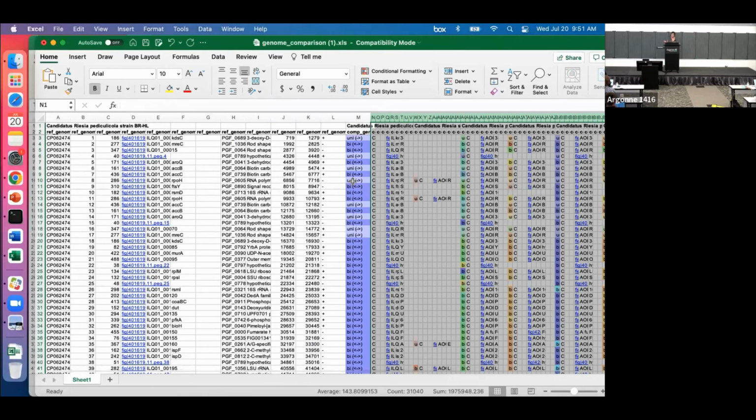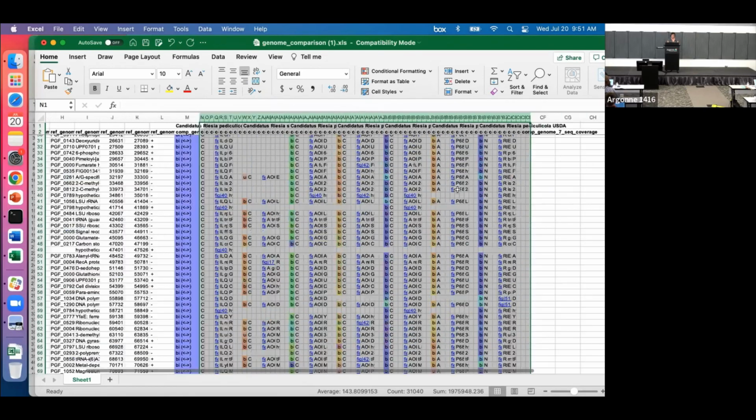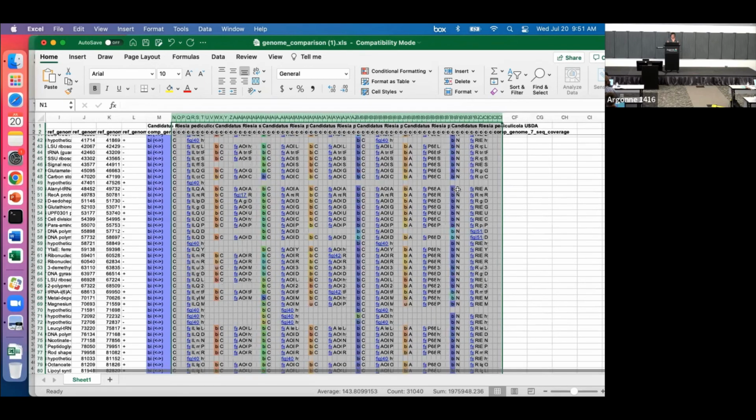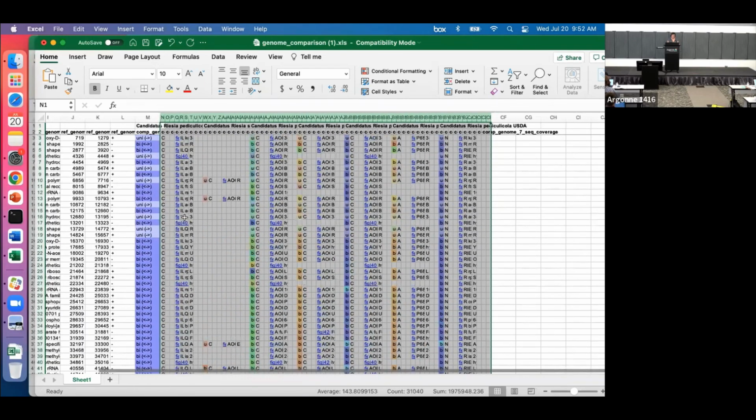And then I have sort of a bird's eye view of these comparisons, and I can quickly scroll through these genomes and see who has what and the strength of those hits. And things like this, I mean, it's not in this case because these guys are endosymbionts, but often where you see these big blank regions, sometimes those are indicative of areas of lateral transfer, horizontal transfer.